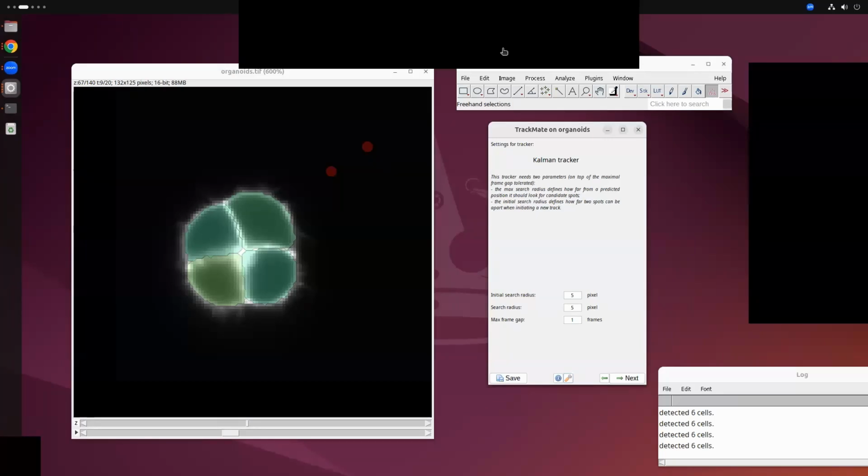And we don't log all the images, but we do some degree of logging for troubleshooting and for informatics and data analytics purposes. But in the future, if the server capability increases, we might save more images. So that is something we cannot say for sure yet.